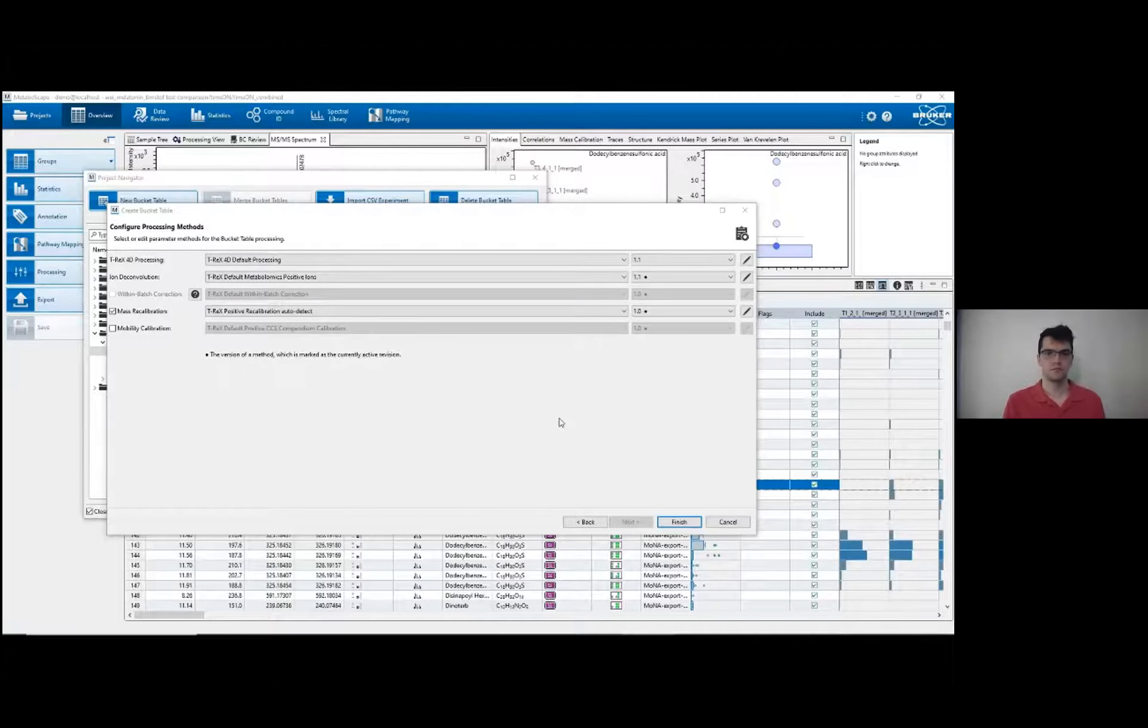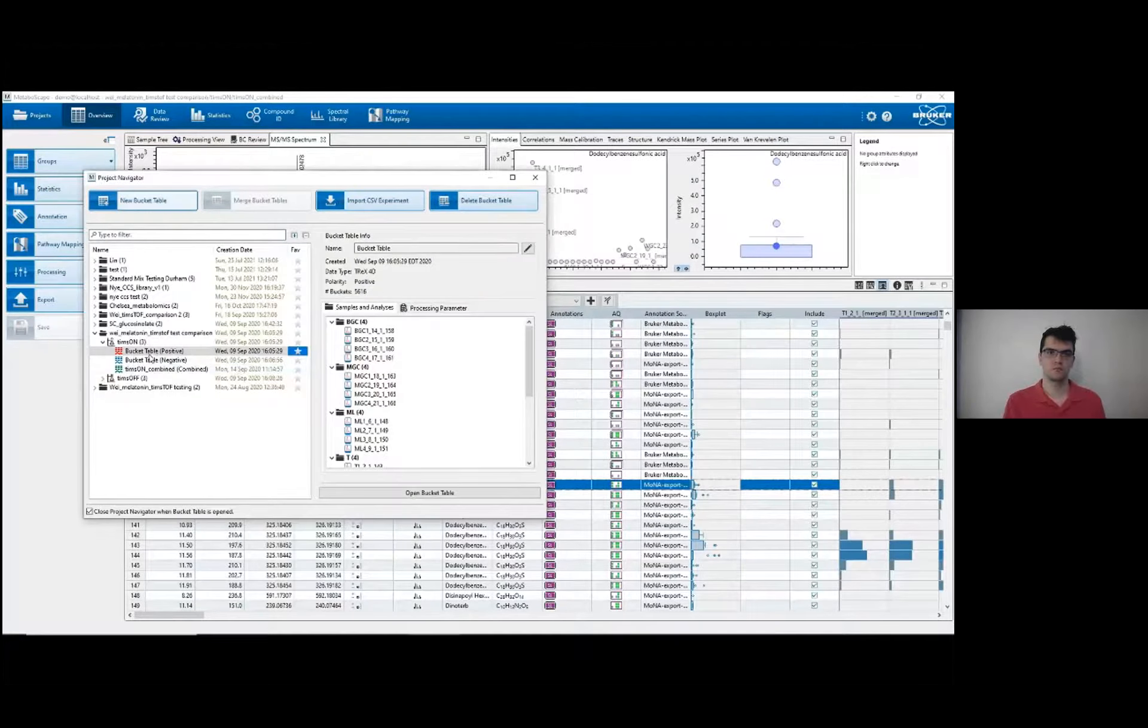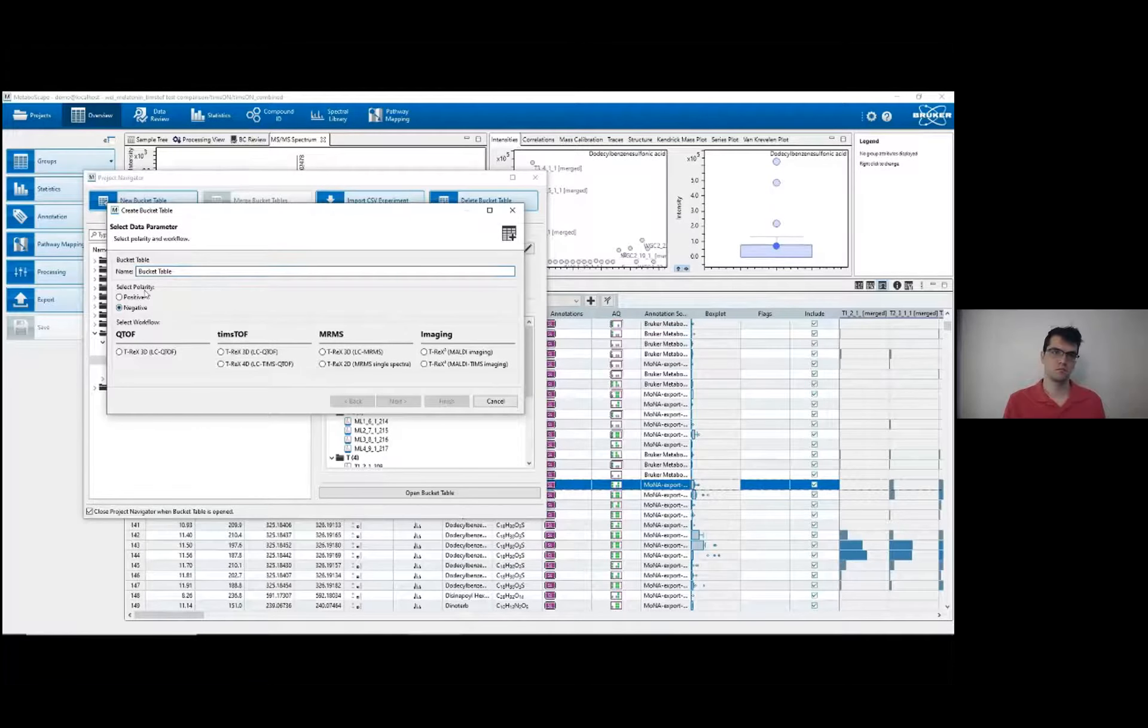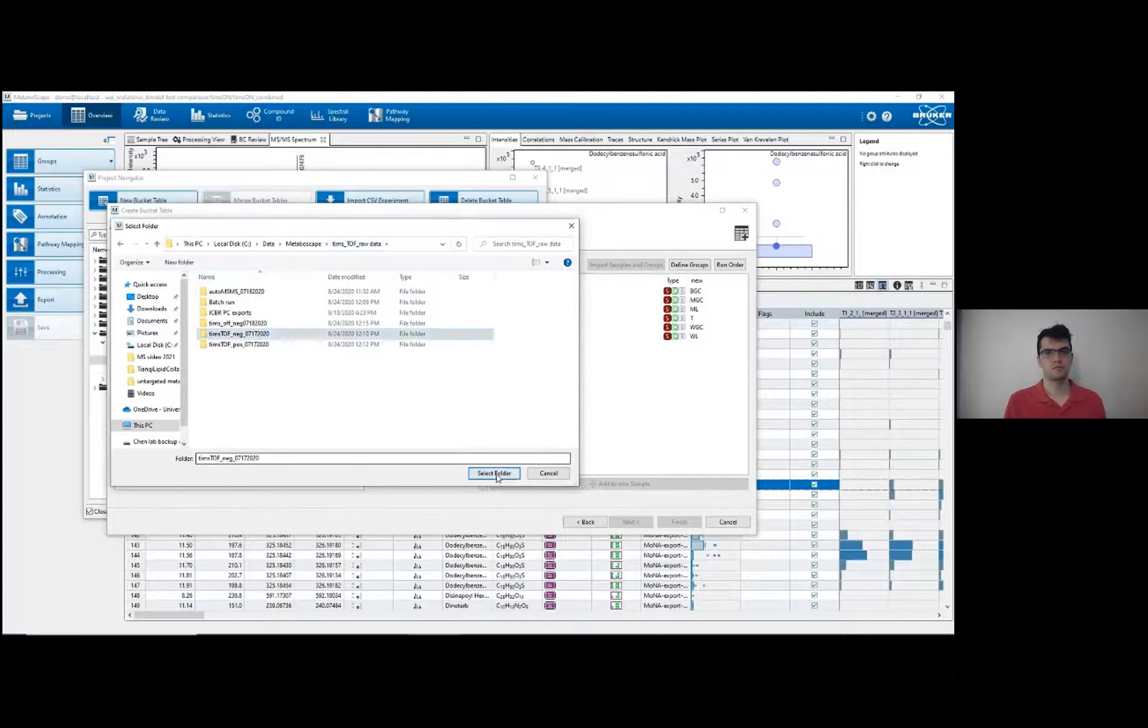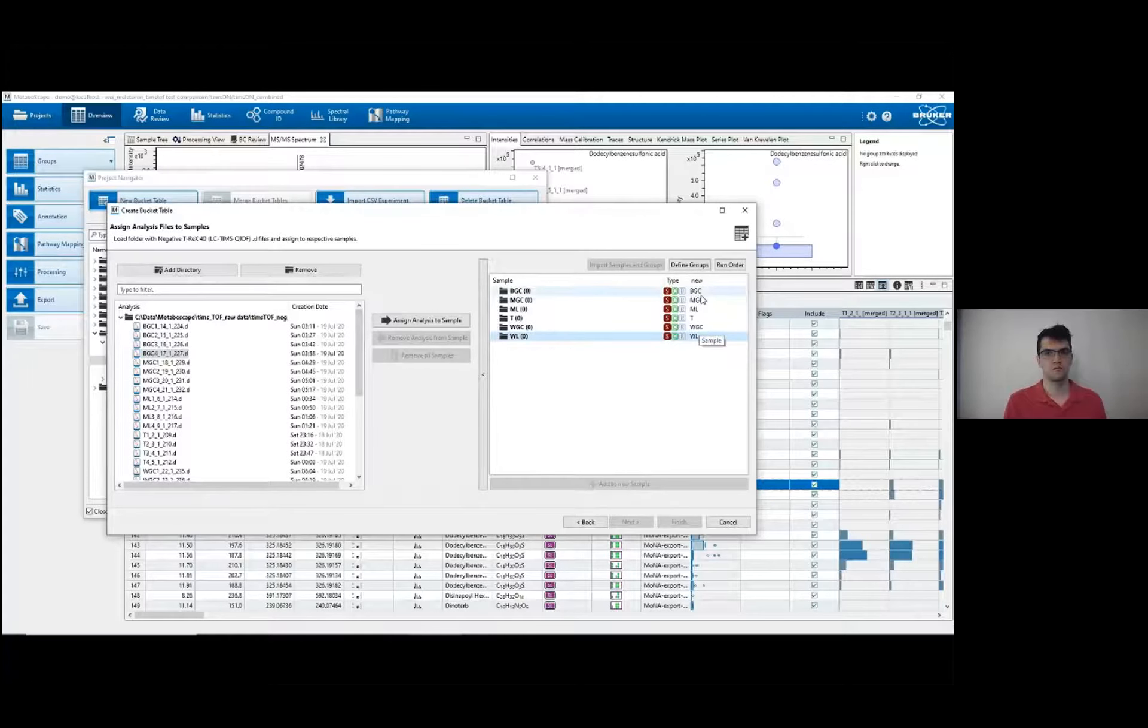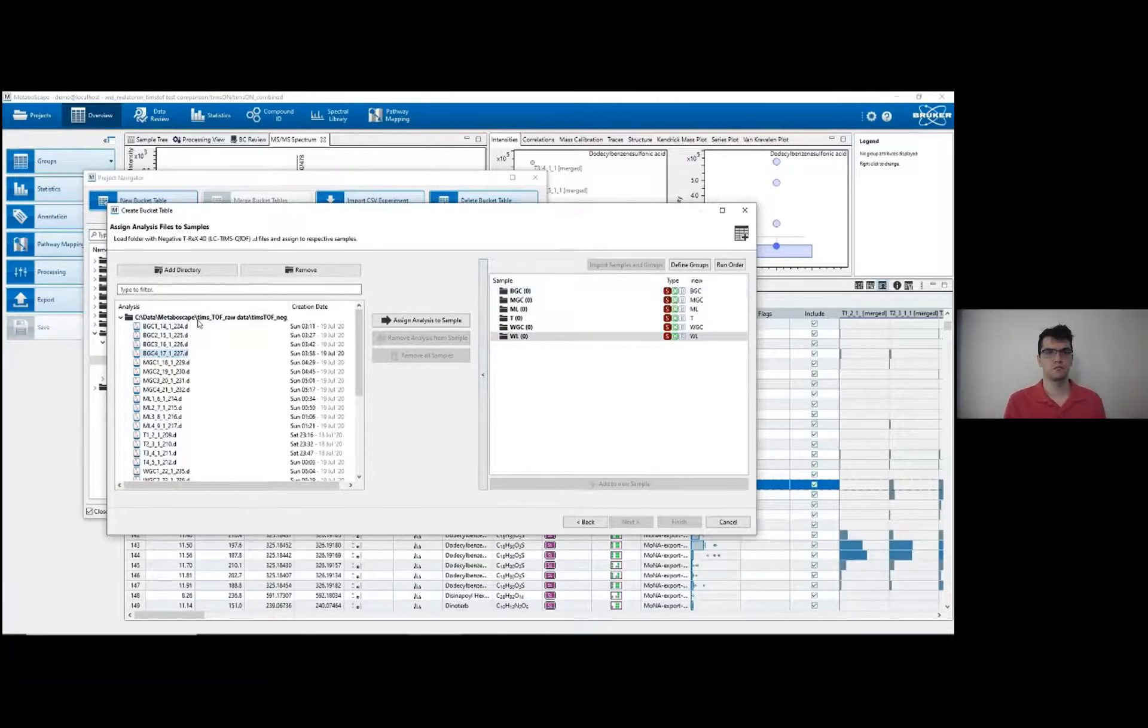There's no further steps now, so I could hit finish if I wanted this data to run. However, I've already ran it for the demonstration, so I won't, especially because it's also fairly CPU intensive. I'll just hit cancel. That would then populate as a bucket table labeled positive here. I would then need to run a negative bucket table. I would do that by hitting new bucket table, within the same experiment and project, select the correct polarity, again select T-REX 4D for the Timstof with TIMS on, go next, and add this directory. That's the negative directory here, and I can add all of these to the corresponding sample. You'll notice that the sample type and the sample groups are preset, since this is in the same experiment. You're not able to change these once you've already set it up and are running another bucket table within the same experiment. So I'll just populate these analyses into these sample groups.